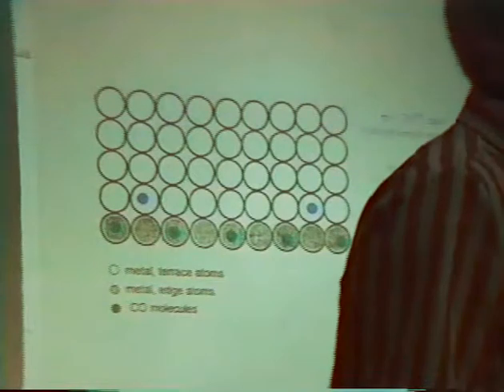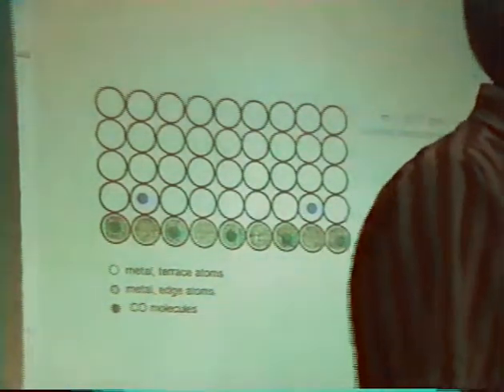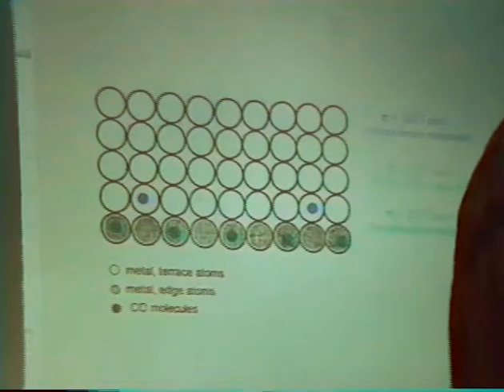Now, let me put that in normal mode language. I would say that there should be a strong normal mode which consists of all of these molecules vibrating in phase together, producing a strong infrared band.